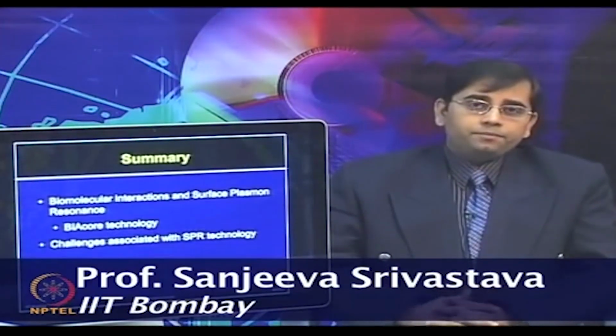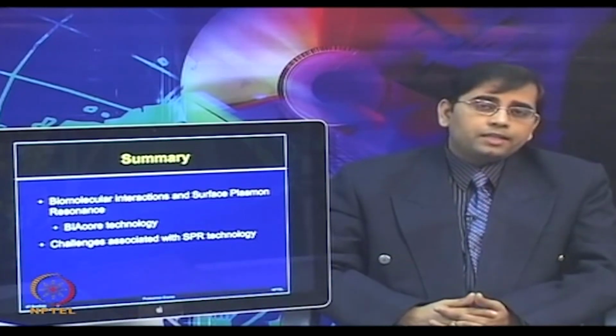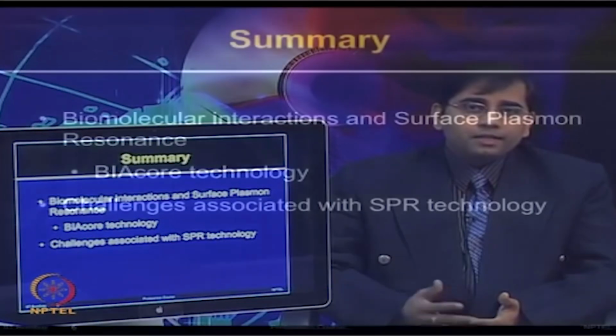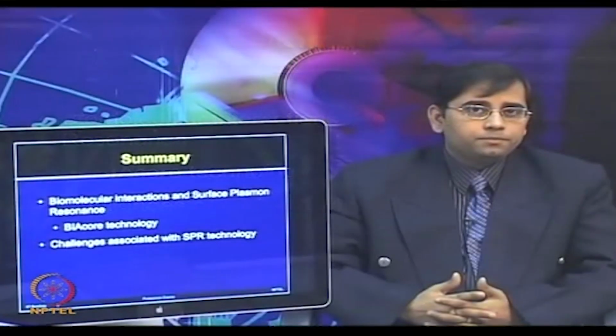So, in summary, in today's lecture, you have learnt about the significance of studying biomolecular interactions, how the surface plasmon resonance technique can be used for studying biomolecular interactions, a brief introduction to Biacore technology and data analysis, and certain issues and challenges associated with SPR technology.